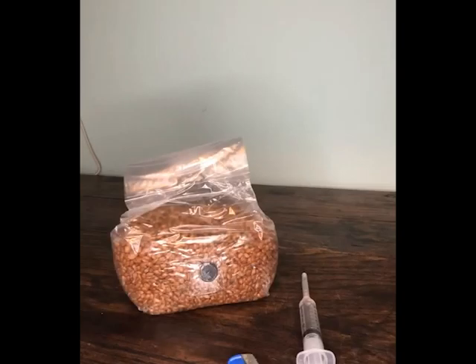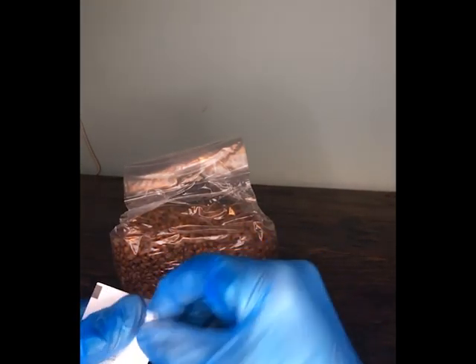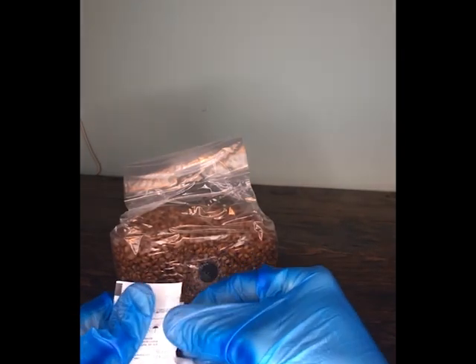One of the most important things to remember when you're about to inoculate your grain spawn bag is to make sure the area around your bag is as clean as possible. We're going to begin by removing the alcohol swab from its packet and wiping down the port on the front of the bag.